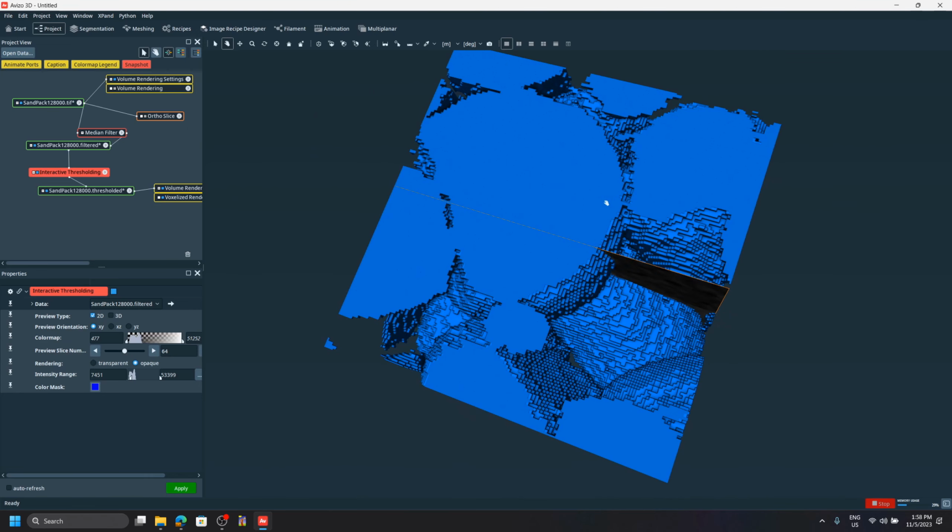So this is a very simple example. You have your data, which is usually noisy, then you apply some filter to denoise, and once it's denoised, you can do segmentation. In this case, I used a very simple method, which is thresholding. Personally, I try thresholding first all the time, because it's a super simple method, super cheap to compute, and sometimes it works. As you can see in this example, it's enough to do the job.